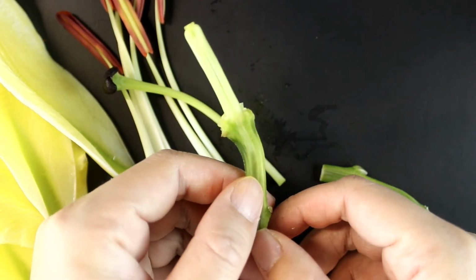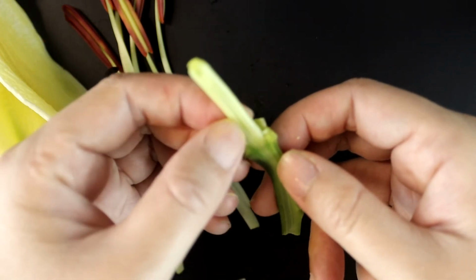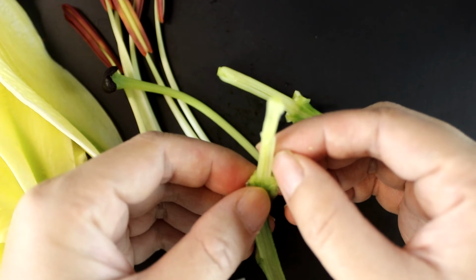Here you can find the ovary if you look carefully, because you can find some ovule-like structures.